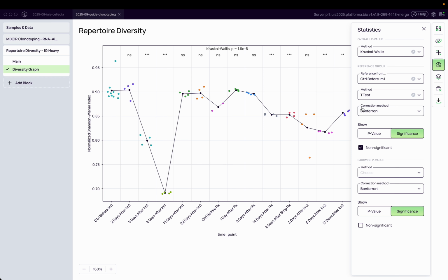And it is very important that this statistics is really comprehensive. Let's say here we use a t-test, and we also apply automatically the correction method. We use a Bonferroni here, and this is important to have the real statistics on the plot.